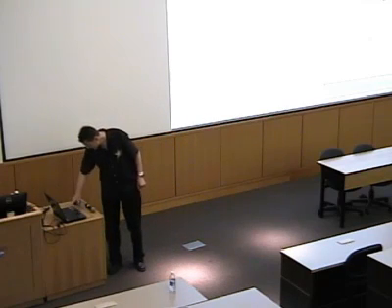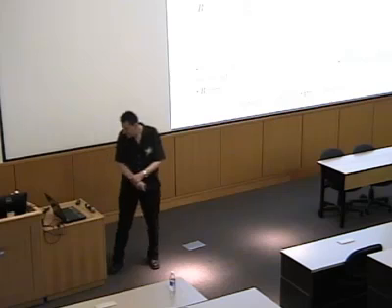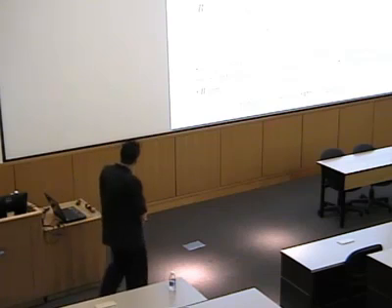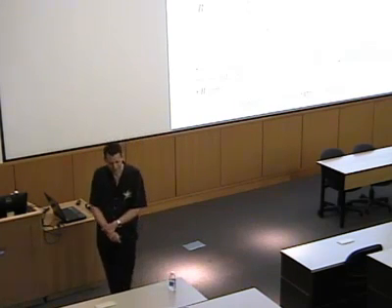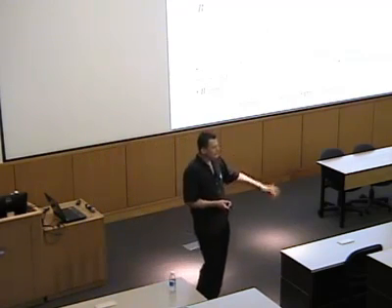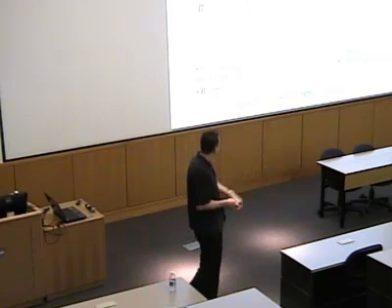So this is the A term mechanism. So the B term is the one that looks most complicated, but in a sense the B term is a variation of the A term. Well, now we do not require anymore that the excited state is degenerate, so we could have a non-degenerate excited state, but as we've seen before, if we have a non-degenerate excited state, we don't get intensity, so we need another state, an auxiliary state, which we call K.